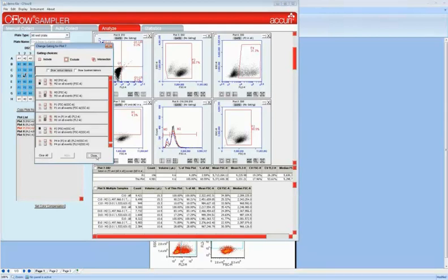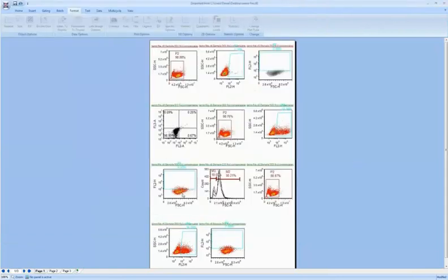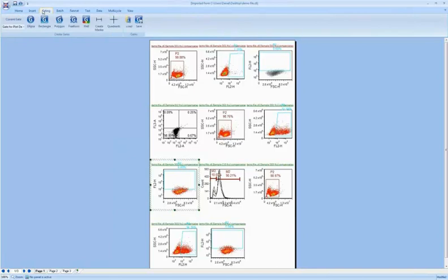So when doing the import, FCS Express figures out what you were trying to do and creates what we call a combination gate to support that. So that's a Boolean gate. And if I go to the gating tab, you can see that this particular plot is using the gate for plot density 7. Now what is the definition for that?